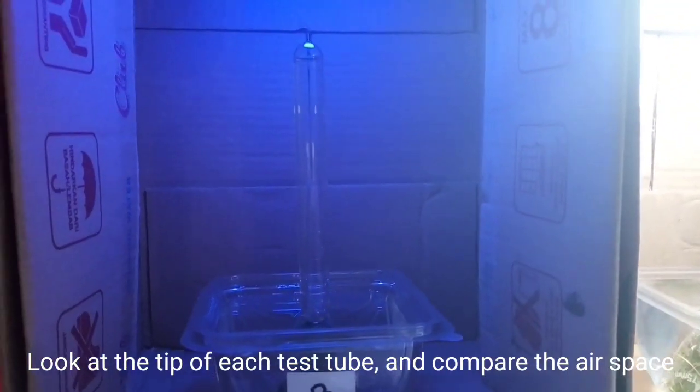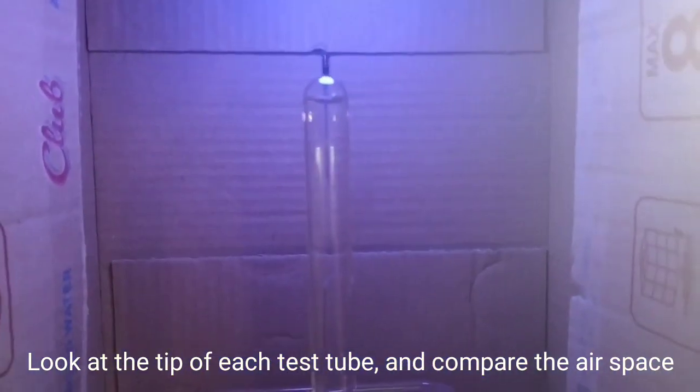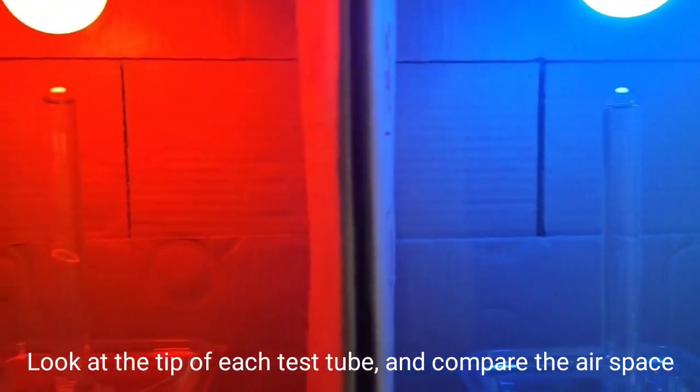After 3 hours, look at the tip of each test tube and compare the air space or bubbles that have formed.